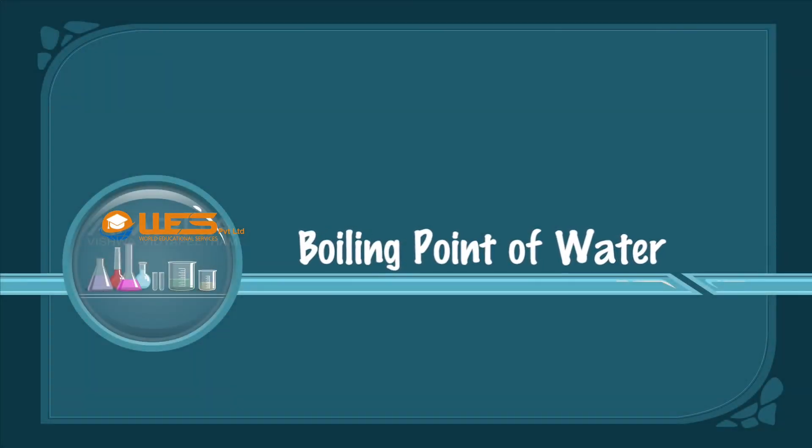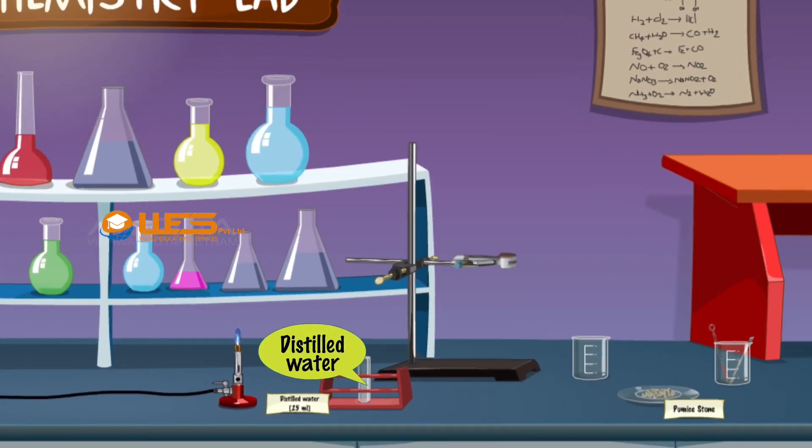Boiling Point of Water. We require distilled water, a boiling tube, beakers, a thermometer, a spatula, pumice stones, a stand with a clamp, and a Bunsen burner.